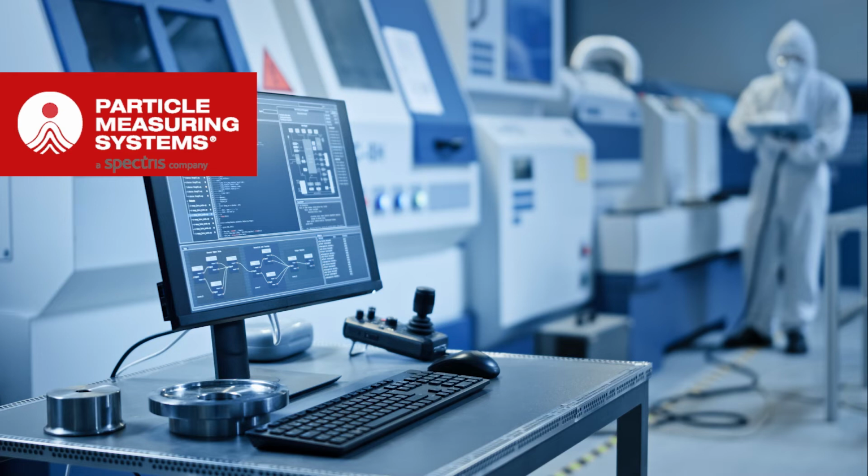When you start to think about a risk assessment, there's severity. Well, we don't have to monitor severity or start to weigh severity because in an aseptic process, everything is critical, everything is severe. You have the probability of something occurring, and that's where we start to drill into what the probabilities of a contamination event are.